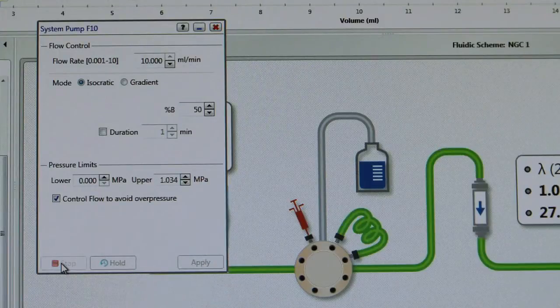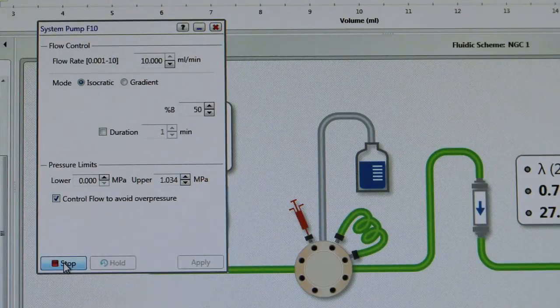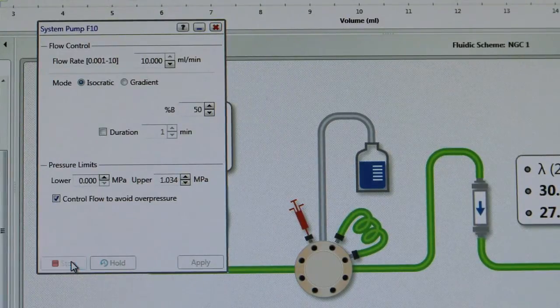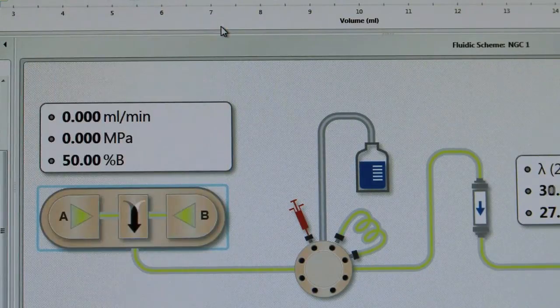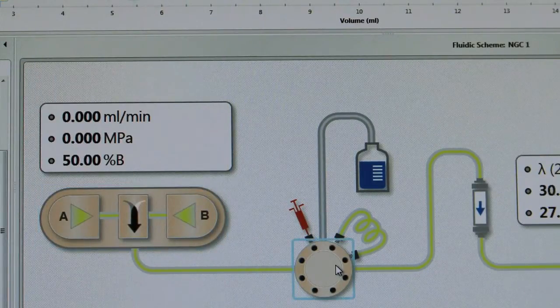Then, click Start and wait two minutes. Click Stop to stop the pump and then close the faceplate. The system is now purged and ready for manual control.